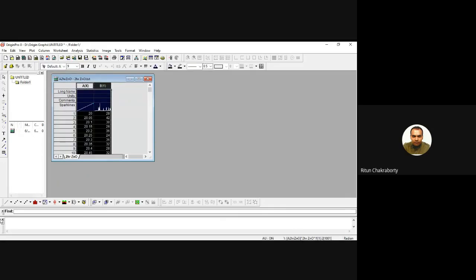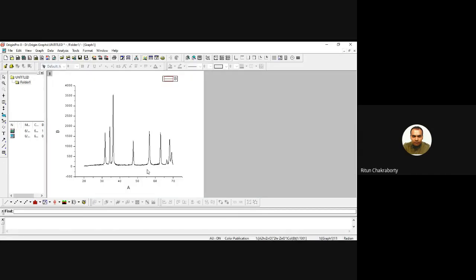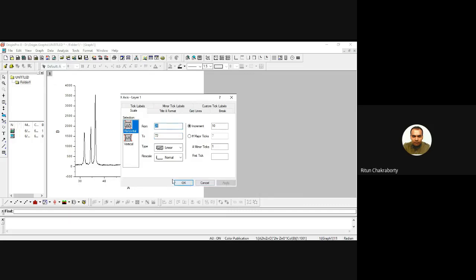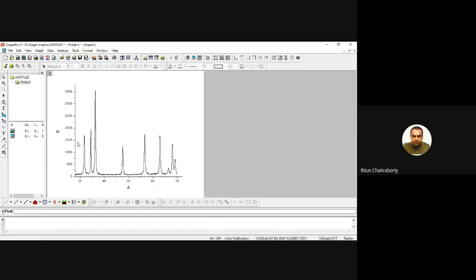Along the x-axis, two-theta angles are plotted, and along the y-axis the intensity of the X-ray diffraction peaks are plotted. Now we plot the data — this is the X-ray diffraction pattern for zinc oxide nanostructures. We can adjust the scales: double-click on the scale, set the x-axis from 28 to 72, and the y-axis from minus 10 to 3750, then apply.